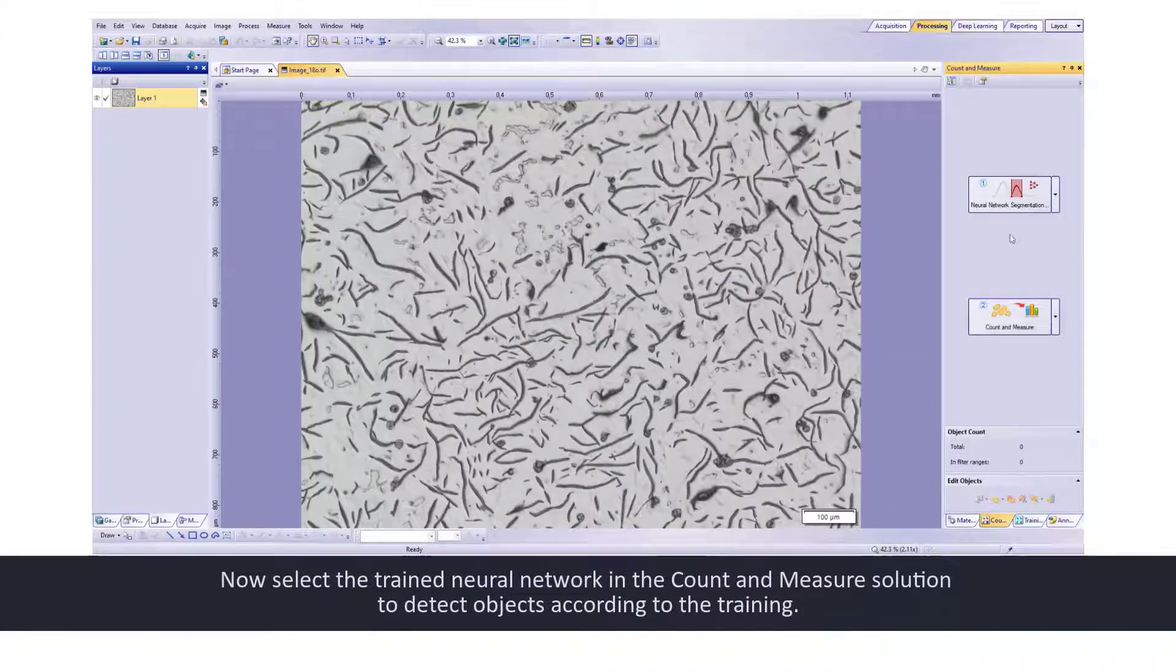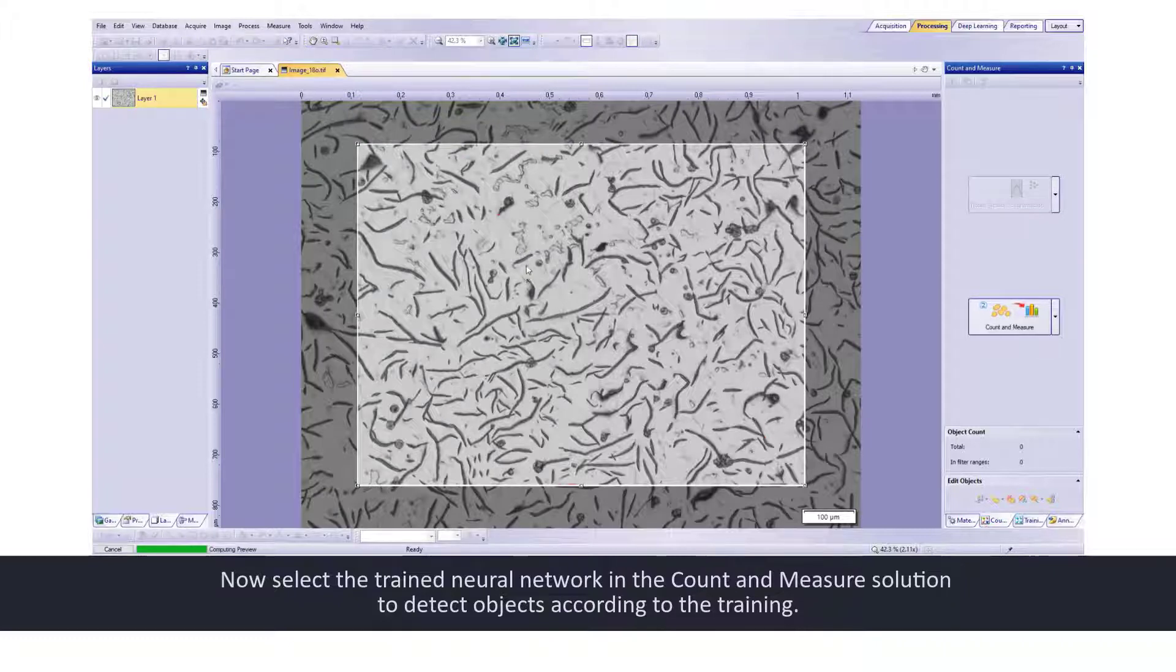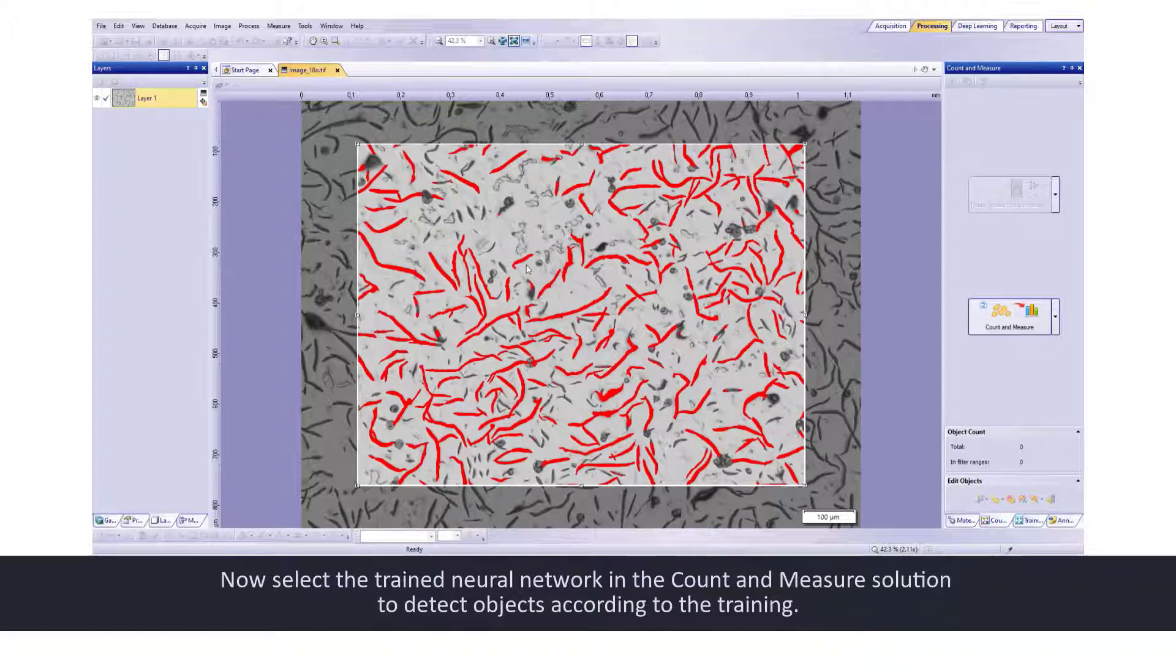Now, select the trained neural network in the count and measure solution to detect objects according to the training.